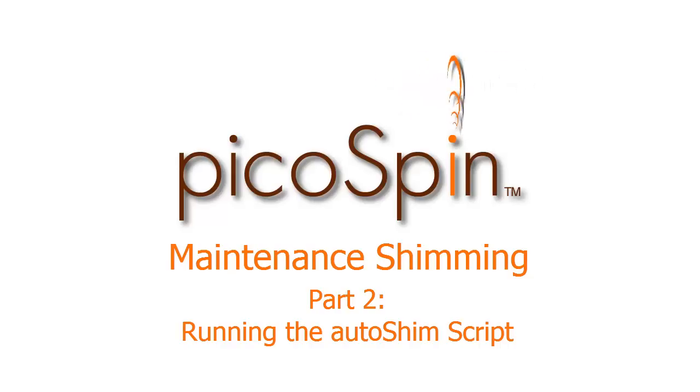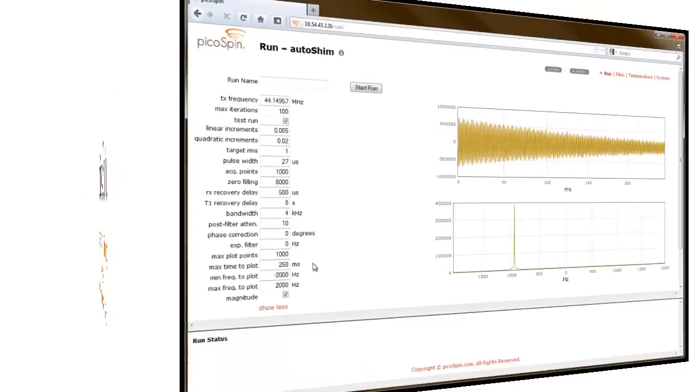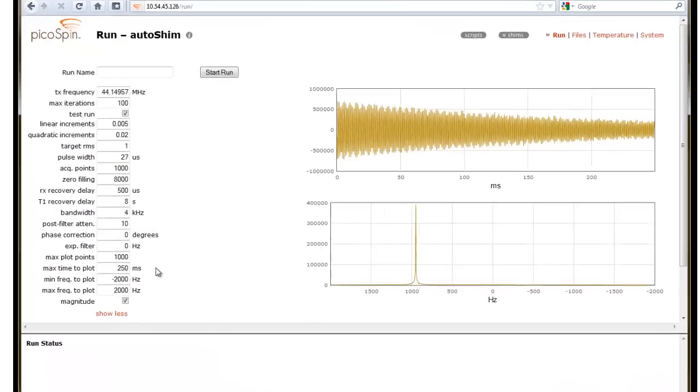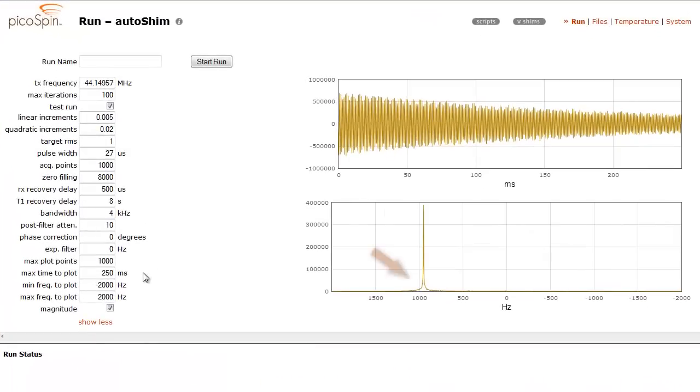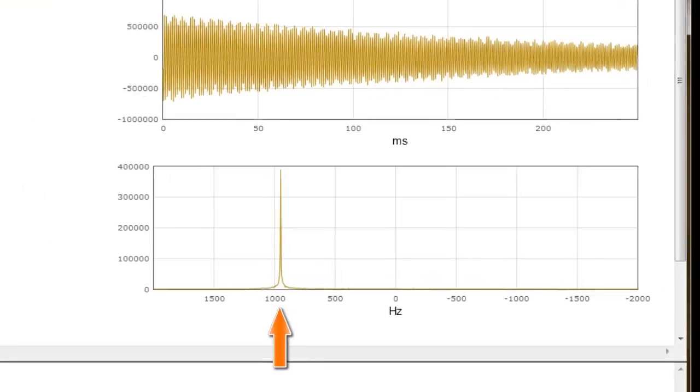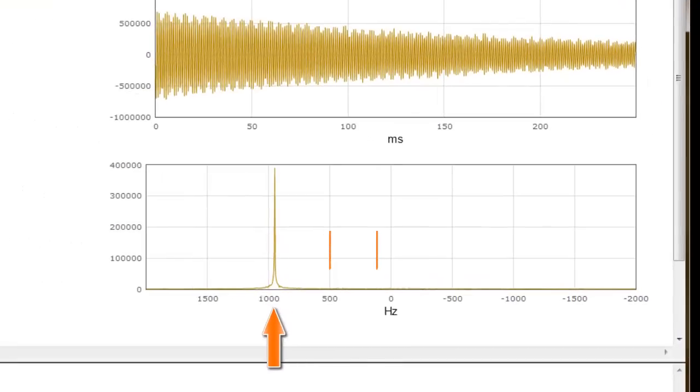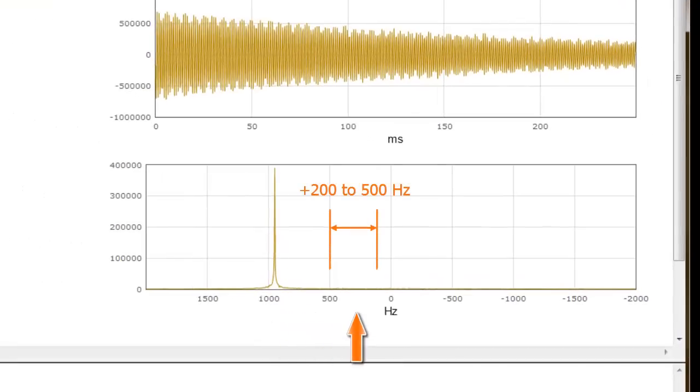Let's get started with shimming. In our spectrum window, we see the signal position is close to 1000 Hz.